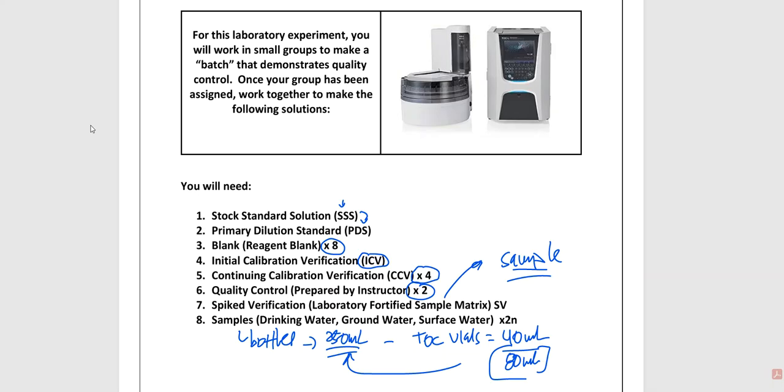That drinking water can come from anywhere. So some people will do their tap water just because they want to know more about it. Some people will bring in 2 samples, and that will be from the fridge.